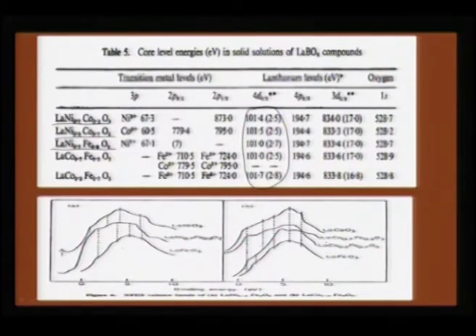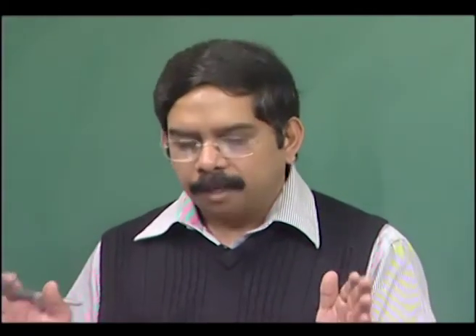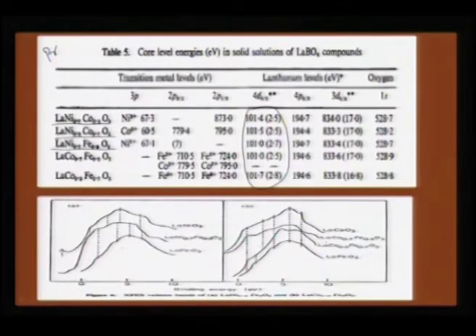In other words, the lanthanum valency is not affected when substitution is going on. Therefore, rare earth peak positions can also serve as an internal standard because they do not exhibit mixed valency, except for praseodymium, which shows 2+, 3+ and 4+ oxidation states.